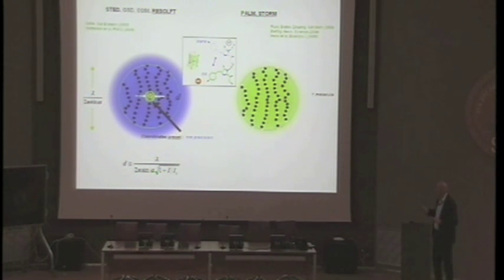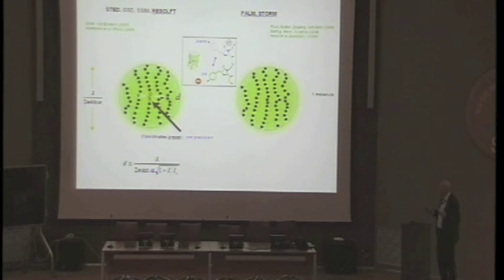Now, in 2006, so in the interim, after we suggested this, an alternative method came up, which has become very successful. It runs under the acronyms PALM or STORM. This is the same thing. And here, this on-off game is played in a different way. Again, the same transitions are used in this initial suggestion, and the on-off game is played randomly in space. So initially, all the molecules are off, say in the trans state, then you turn them to the bright state, the cis state, with a weak beam of light that is not focused, but at some point somewhere a molecule will go to the on state. You see it goes to the on state, and if it goes at some point within this 200 nanometer zone, of course you have no clue where it happens, no idea.